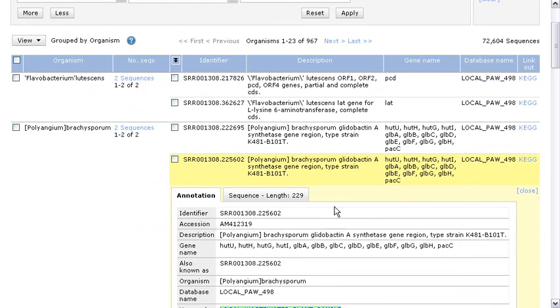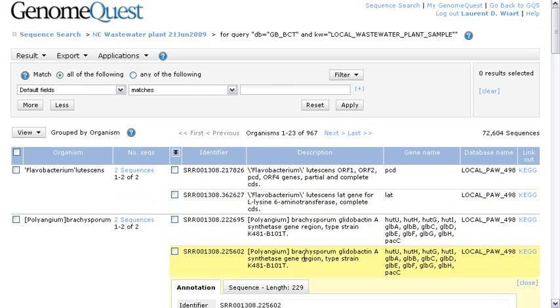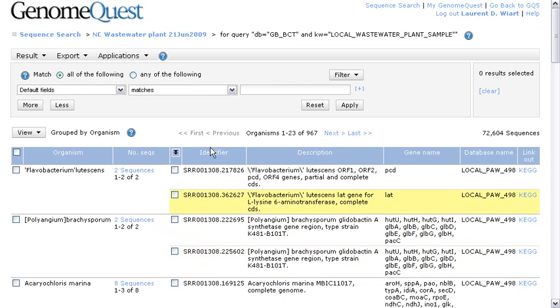And again, we could expand the row to have a look at the annotations in more detail and also about the alignment. So let me close it.